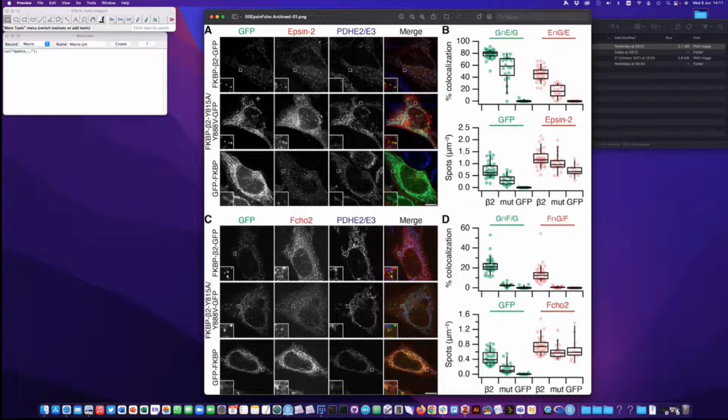So those are the sorts of things that we can standardize in this figure maker. Just a note about color blindness. In my lab, we use red, green, blue merges, and we get around the color blindness issue by showing these separate channels. So if you're colorblind and you can't see red as a separate color, then you can just look at the separated channels.